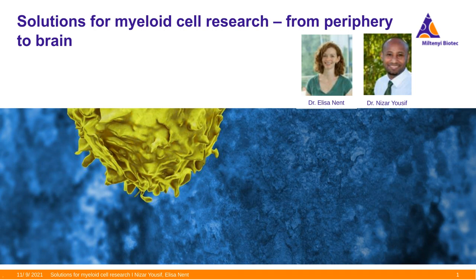Well, with the MACSxpress Whole Blood Neutrophil Isolation Kit, human neutrophils are not isolated based on density. So therefore, both normal density neutrophils and low density neutrophils should be isolated. In the MACSxpress technology, the aggregated erythrocytes are sedimented at the bottom of the tube, whereas non-target cells are magnetically labeled and adhere to the tube walls as long as the tube is placed in the magnet. So I don't see any difficulties for getting your neutrophils of interest using this kit.